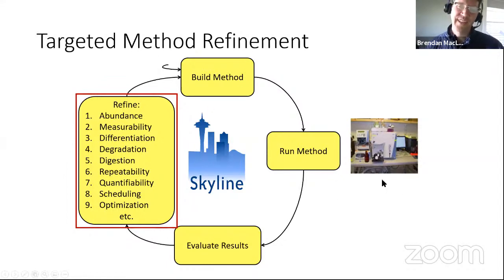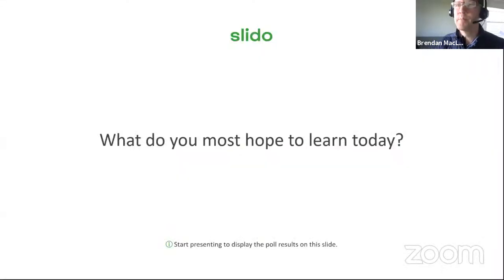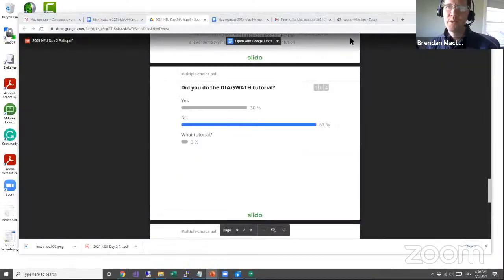We have the 2 data sets, they've already done it, and so I was able to do, I guess it's kind of a repeatability refinement. It's basically a repeatability experiment, looking at the coefficients of variation of the peptides. So that's it for slides for today. I'll get rid of that too.